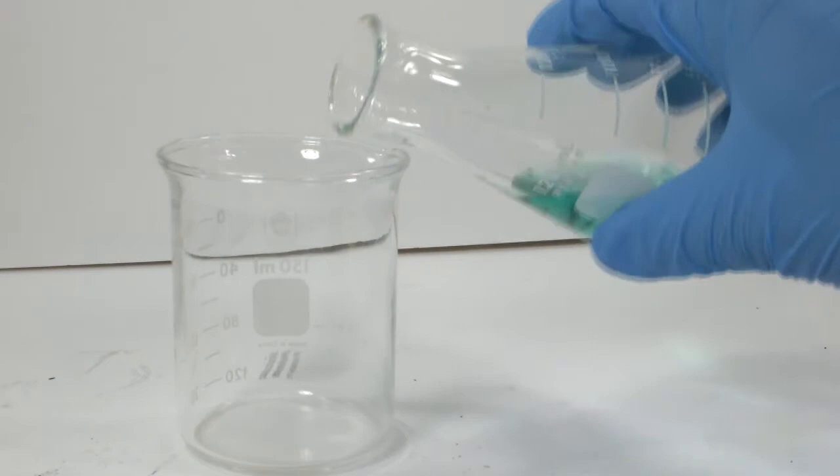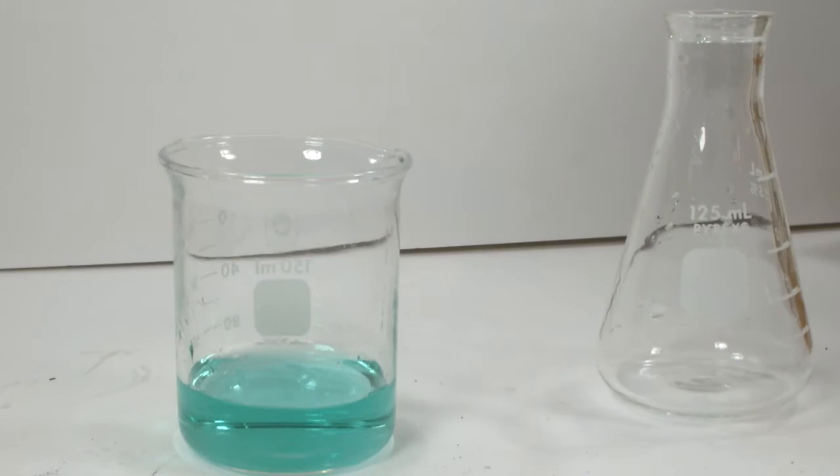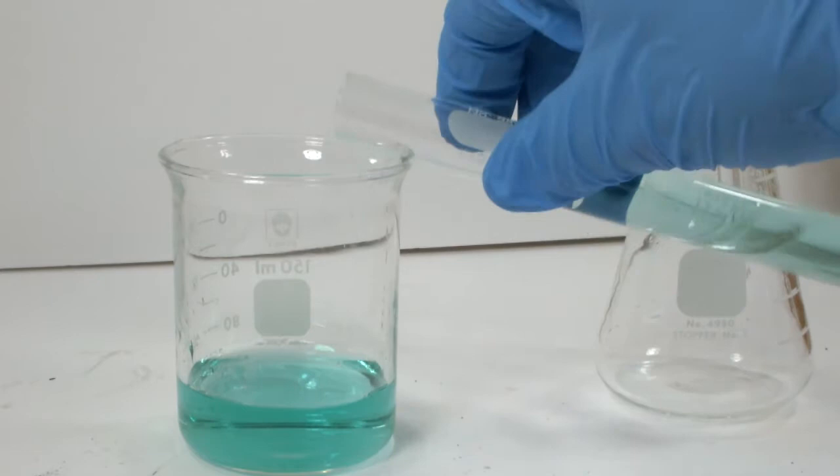Let's go back to the chloride while the sulfate chills. First, we'll put it into a beaker so it's easier to work with.